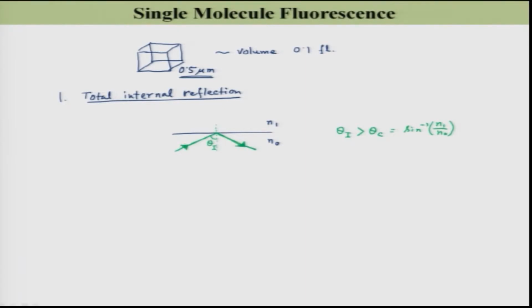but still what you are going to see is that an evanescent field around this region will be generated. This is nothing but a near field standing wave.